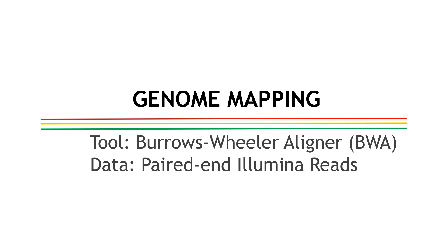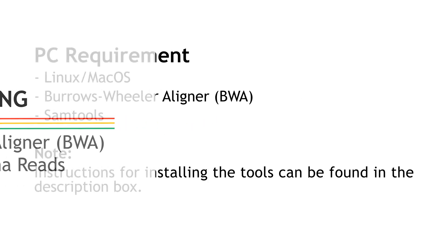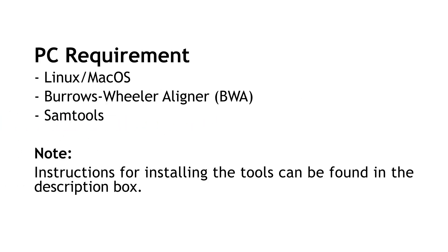In today's video, I am going to show you how you can perform genome mapping using the Burrows-Wheeler Aligner software, or BWA for short. For this tutorial to work, you need to make sure you have a Unix-like operating system, i.e. Linux or Mac OS, and you also need to make sure you have BWA installed. I already have separate tutorials that show you how to install BWA, so you can watch those videos to set up your PC.